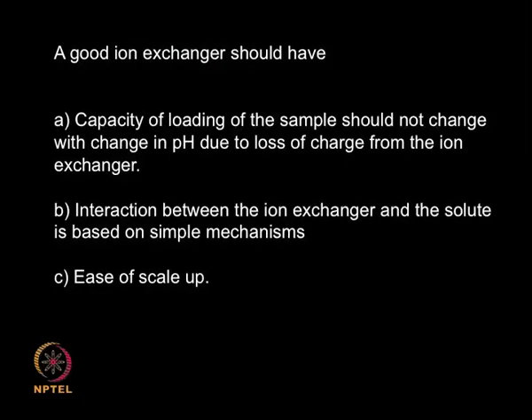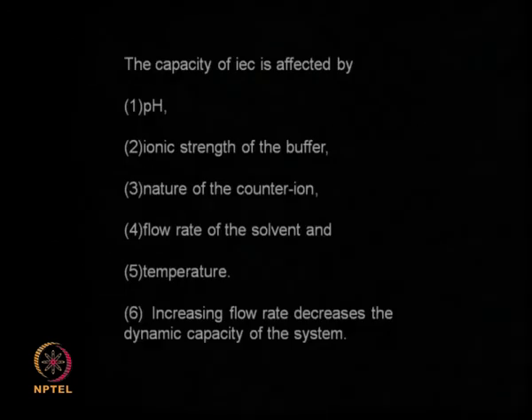Okay, a good ion exchanger should have capacity of loading of the sample that should not change with the change in pH. So change in pH should not affect the capacity of the loading or cause loss of charge from the ion exchanger. Interaction between ion exchanger and the solute should be based on a simple mechanism. It should be easy to scale up, because I may be wanting to do an exchange in a very small lab scale setup, then I want to scale it up to a very large manufacturing setup. So it should be easy to scale up.